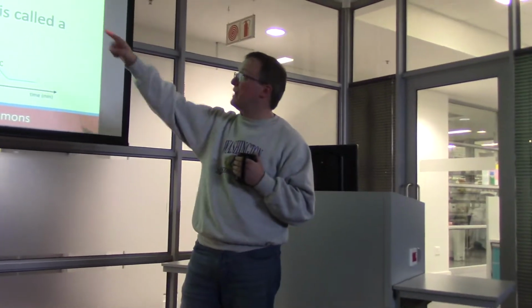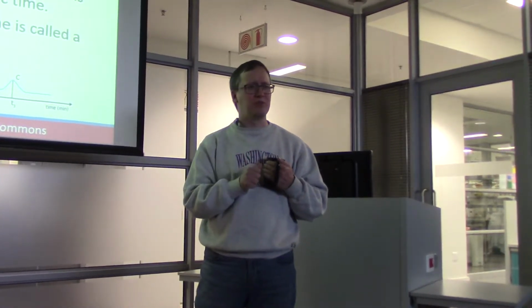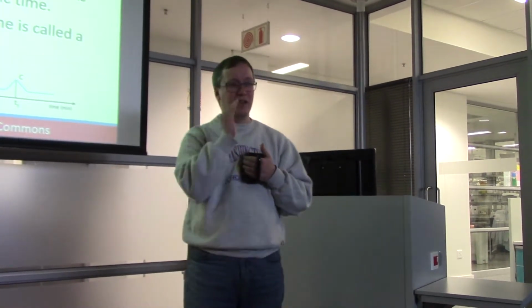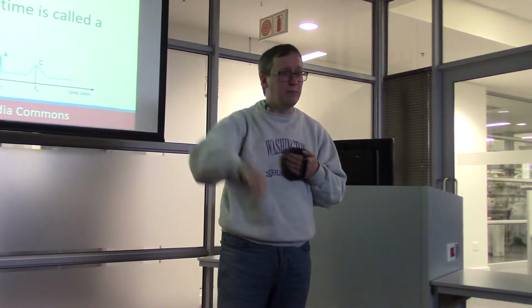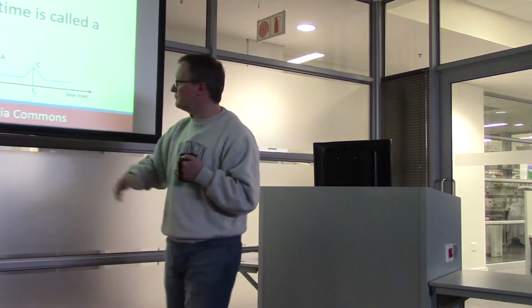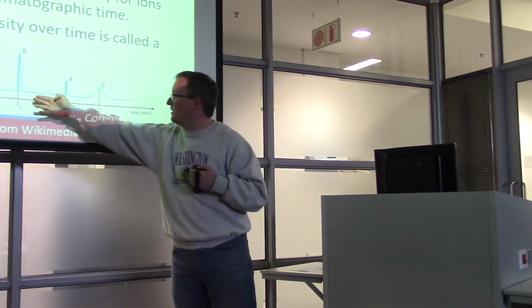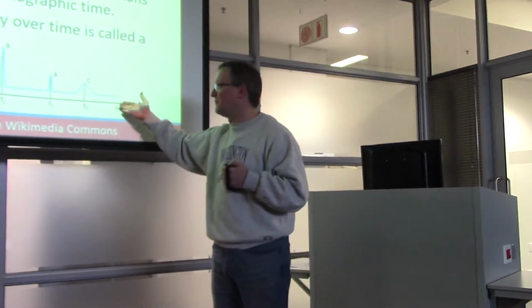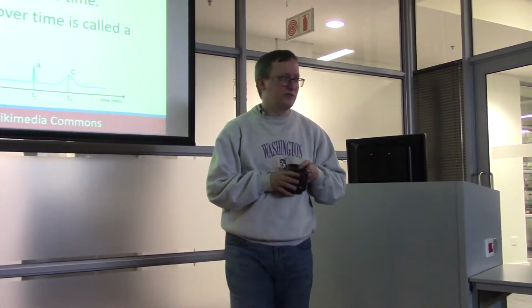When I get to chromatograms in this context, I'm really talking about extracted ion chromatograms, or XICs. An extracted ion chromatogram is about a particular ion's passage over time, the intensity associated with that particular ion as a function of time. So a chromatogram then is a record of how much electrical intensity we're getting from the detector of the mass spec as a function of time. That is a chromatogram. So I think that you can argue lots of things from a chromatogram.